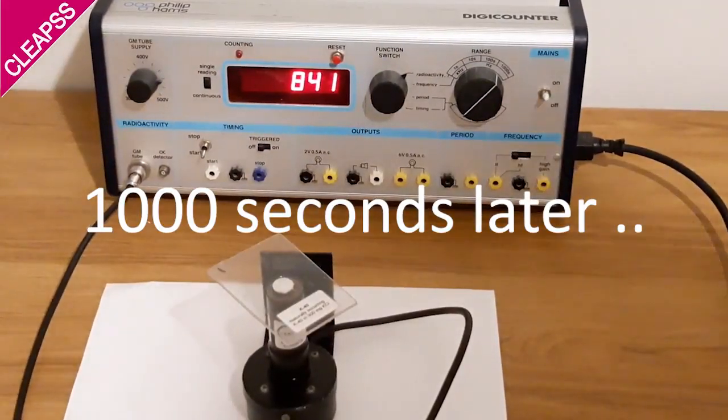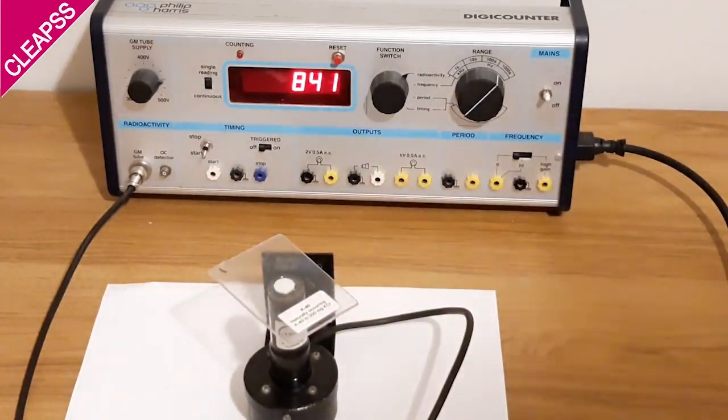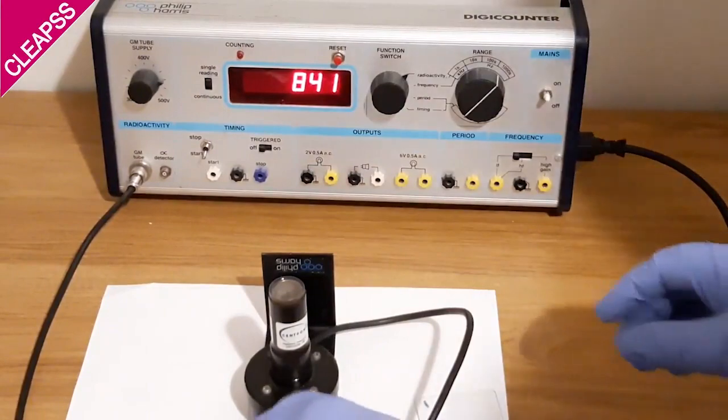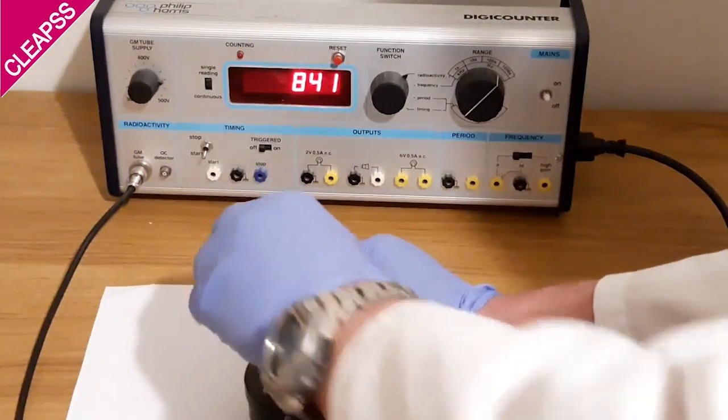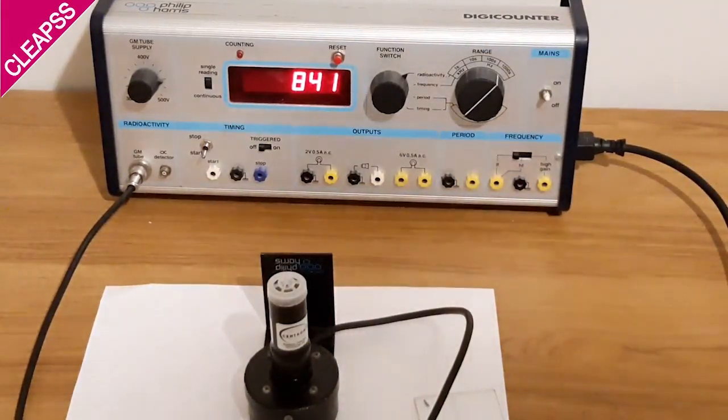After 1000 seconds with the test source, take the count, in this case it's 841. Remove the test source, replace the cap, and then go on to calculate the comparative GM tube efficiency.